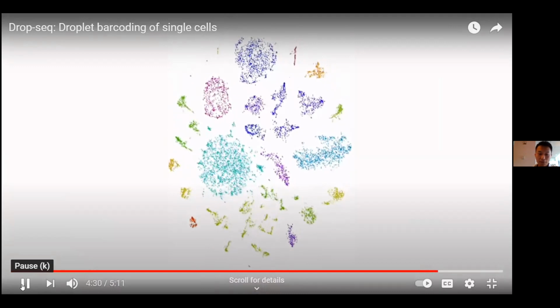So we'll talk later about this clustering in our upcoming tutorial, how we actually identify and differentiate all these individual single cells to see their identity and their functionalities. Visually, we use different clustering techniques that capture the information of the individual cells and then find their similar cell types, such that we can characterize them.